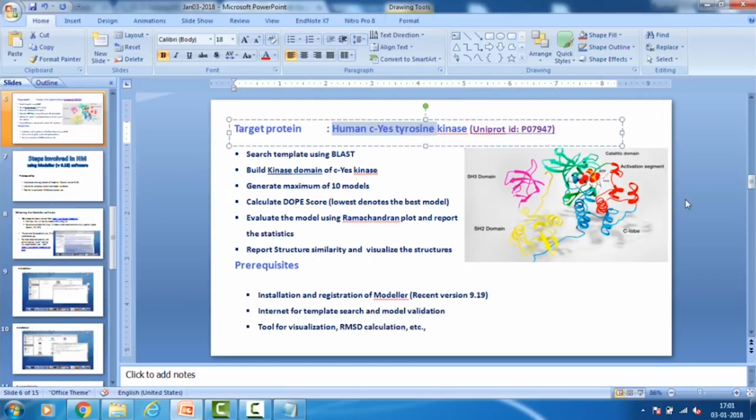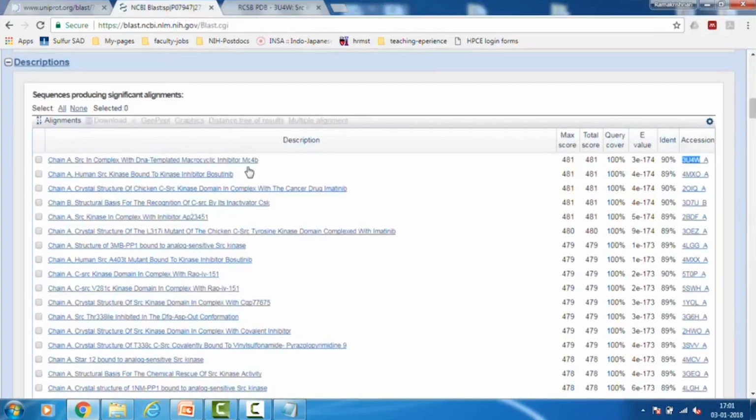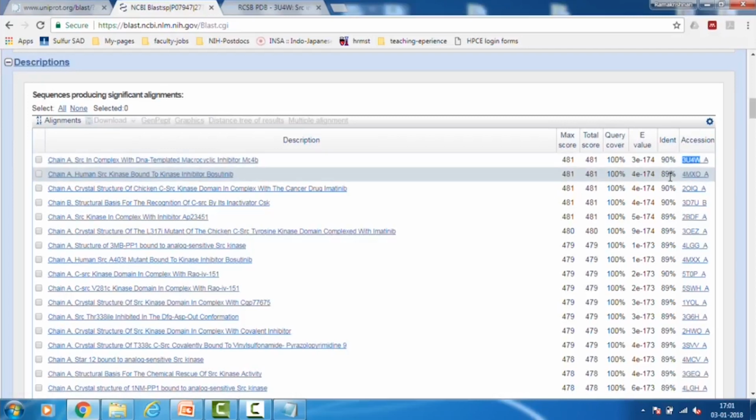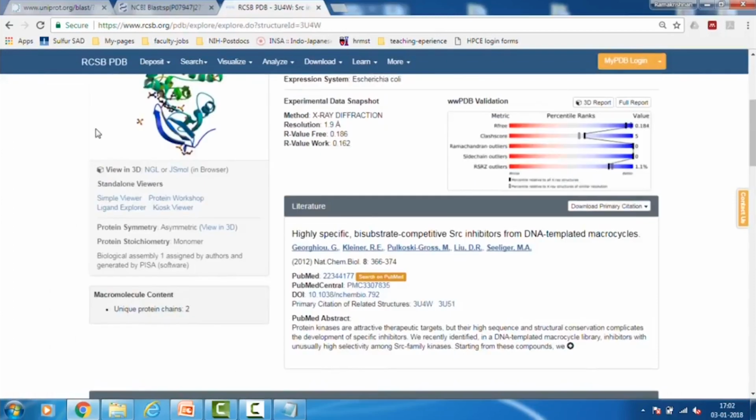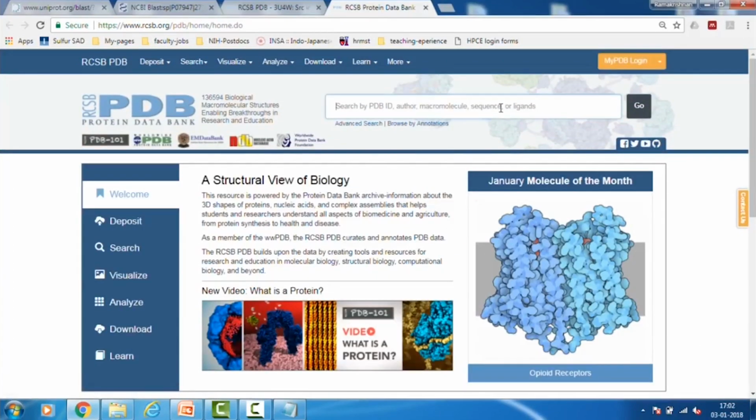So, in this case we have to see carefully whether any of the other hits in the BLAST belongs to human. If you see the second hit, which is also equivalently good, only the percentage identity is less, but still 89% is good. So, if you go to 4MXO and search, go to PDB and see how this structure exists.